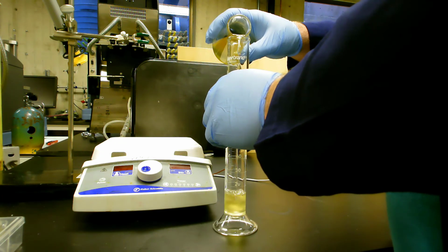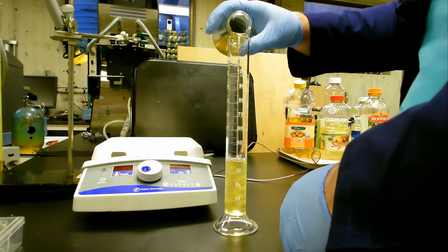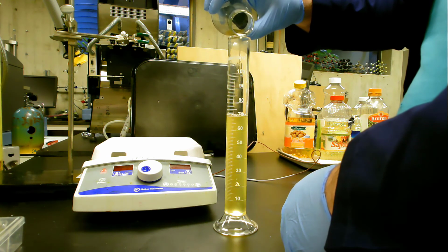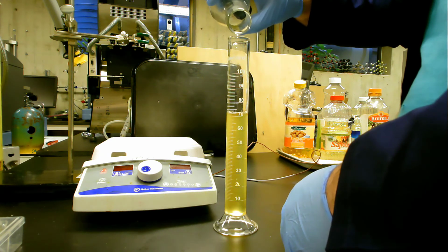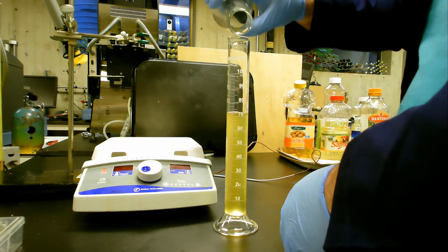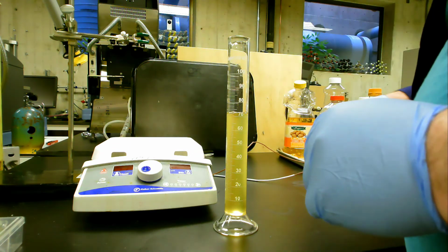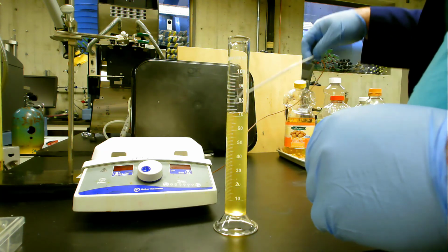So this solution is around 50 degrees C, which is not going to burn you, but it is quite hot. So we're very careful in our pouring procedure. After we're done pouring, we are going to put a cover on top of our graduated cylinder and leave it to cool. There will be 2 layers that form, which are the 2 different major reaction products, one being the biodiesel and one being glycerin.